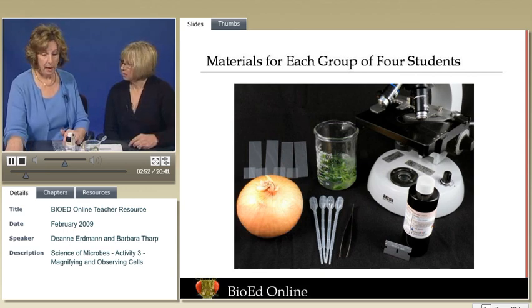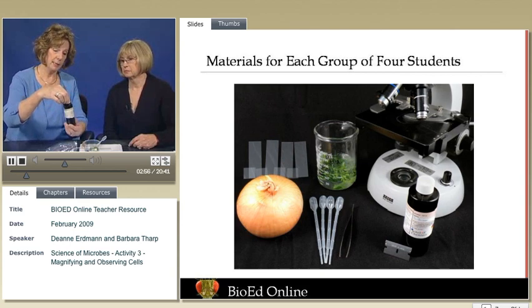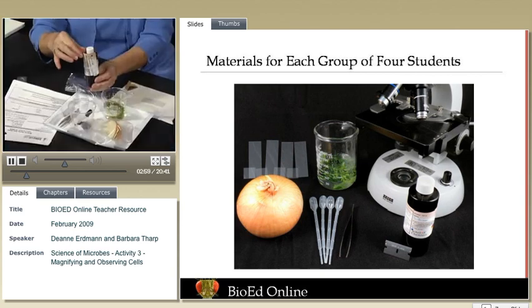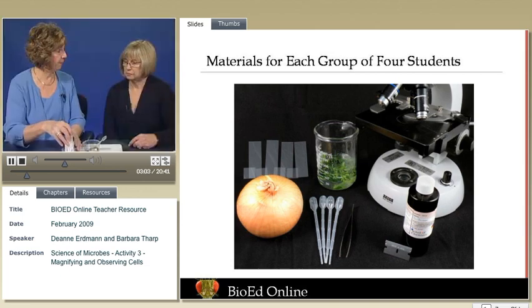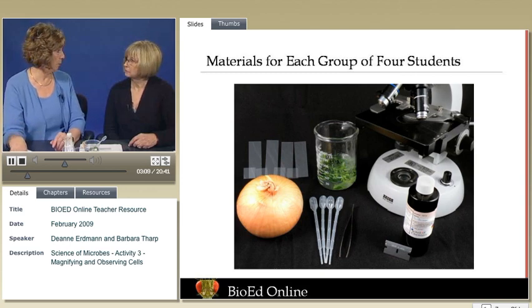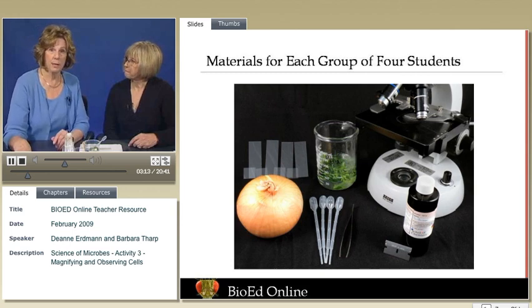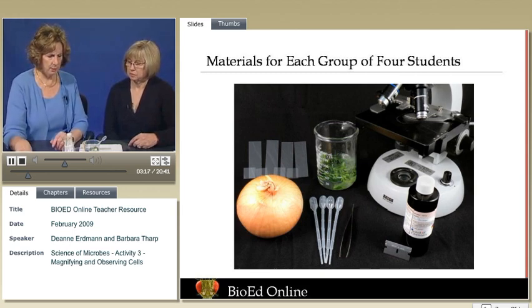Where do you get it? You can see that this particular container, when it was shipped, has a material safety data sheet here. But before we came in to film this activity, I just went on the web and put in the particular chemical I was interested in and pulled one up. So they're widely available, very easy. And if it's something you're using all the time, laminate it so that you just have it in your folder to use each time. Definitely.